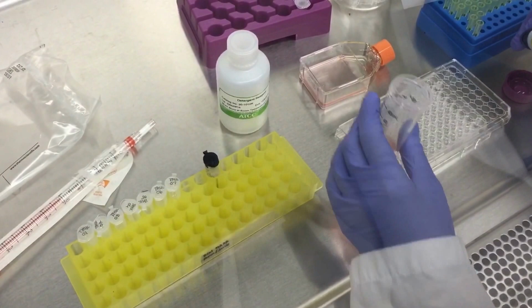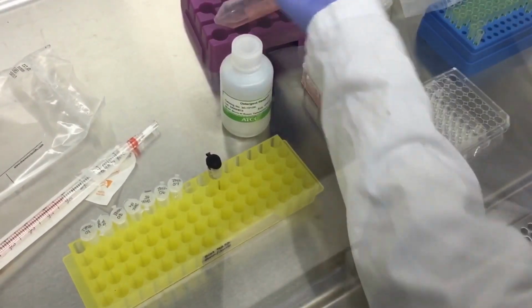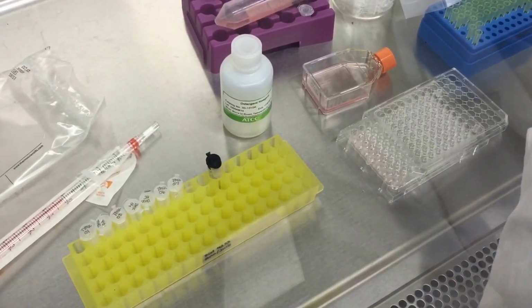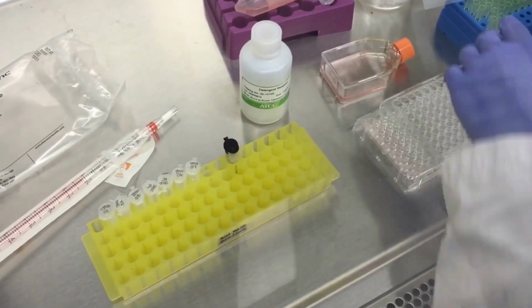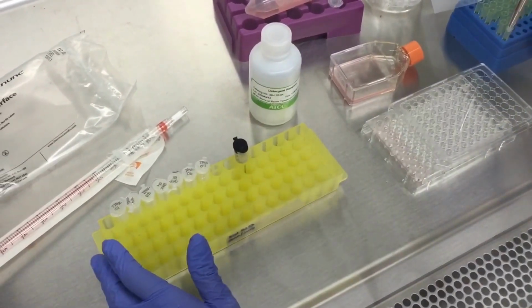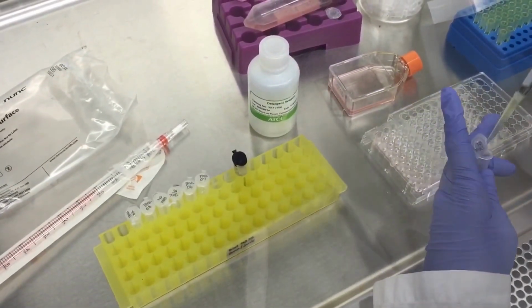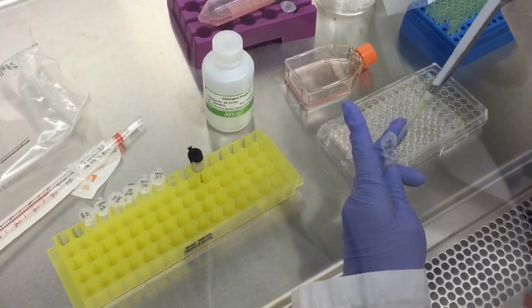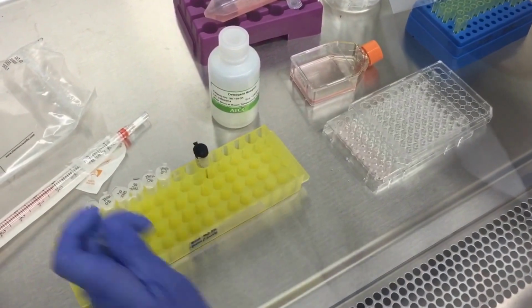Now we're going to put in 10 microliters of the compounds that we're going to be testing into all the wells except for the first two, which is just cells and media. And the concentration that you'll be testing is, your final concentration will be 20 micromolar. So we're taking 10 microliters from a 200 micromolar stock.